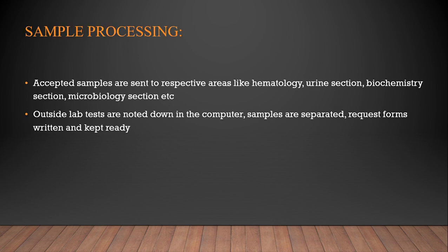Okay, now while receiving the samples, we have to have acceptance criteria and rejection criteria also. Rejection criteria will involve something like the name and UHID number of the patient not being on the sample collection device, or there being a mismatch or anything. This is a part and process of sample receiving itself, and during NABH classes I will elaborate on some of these rejection criteria and acceptance criteria.